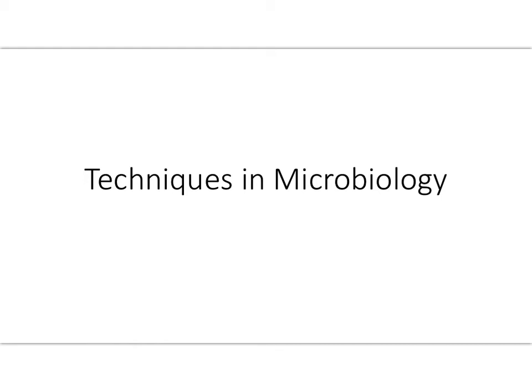In this lecture, we are going to go over some of the basic techniques we use in a microbiology lab setting to help us grow, visualize, and identify certain microbes. This lecture really is designed just to give you some basic ideas, basic vocabulary, and basic concepts about these techniques, so that A, you know what I'm talking about in later units when I mention these types of things, and B, you're a little bit more prepared for some of the material that you'll be going over in lab.